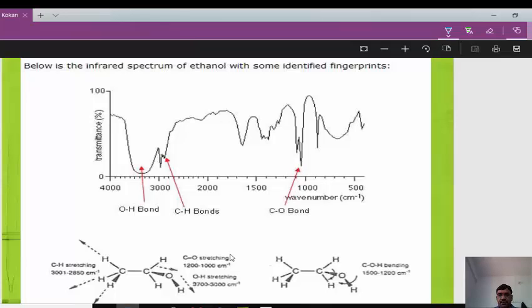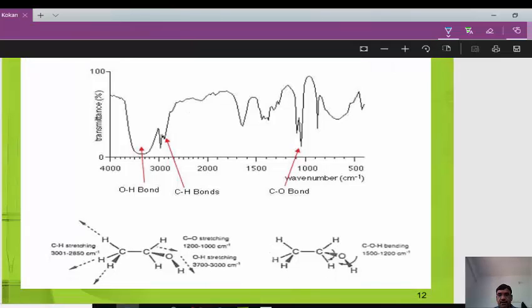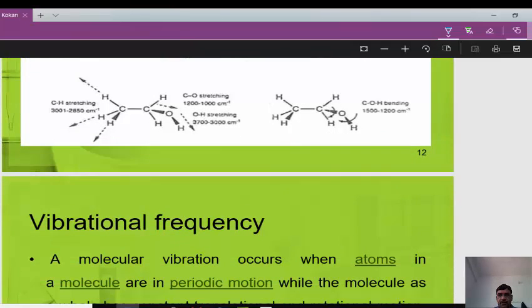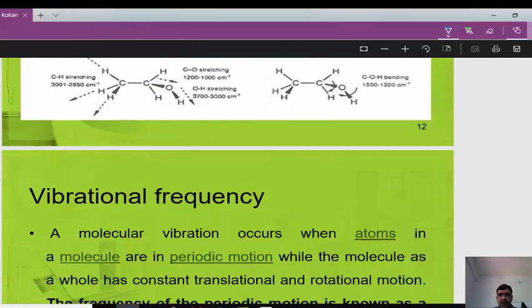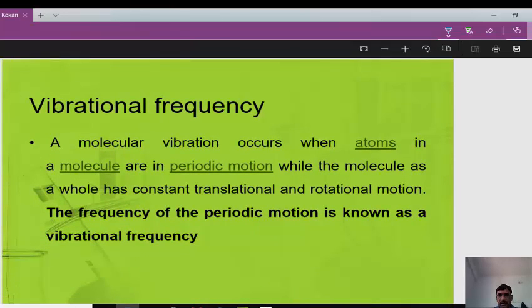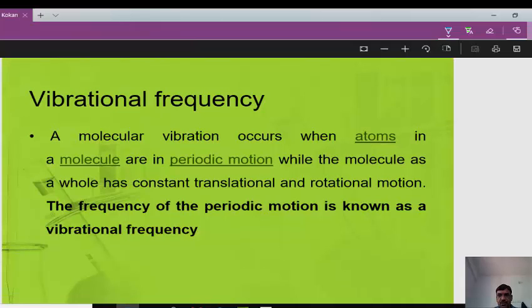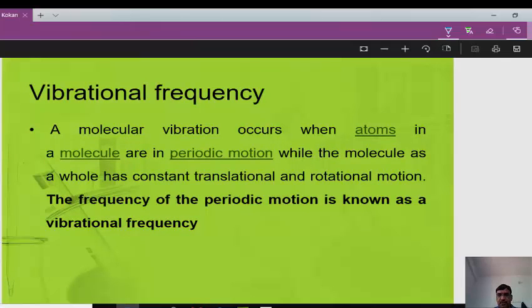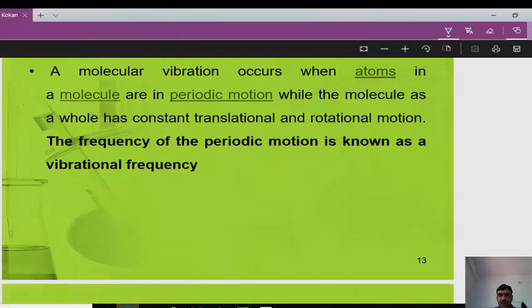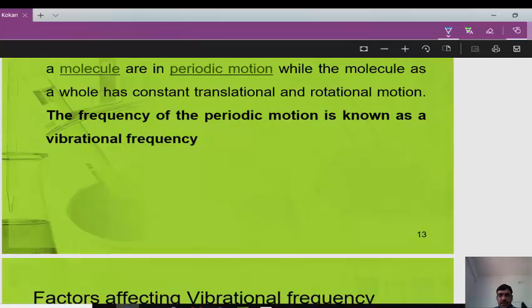The infrared spectrum of ethanol shows several identified fingerprint peaks. Ethanol contains an OH bond (primary alcohol) showing a broad OH stretching peak. CH bonds are also visible, and the CO bond appears at around 1200 per centimeter. The structure of ethanol is shown here.